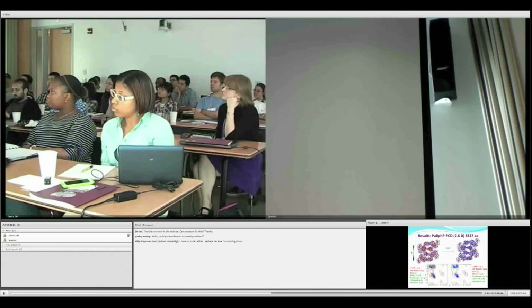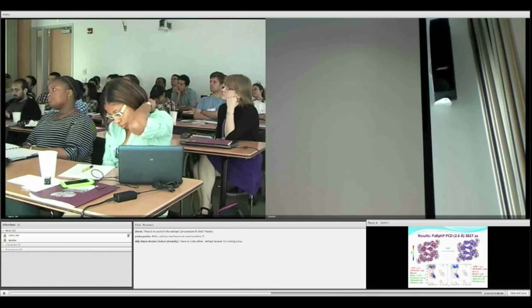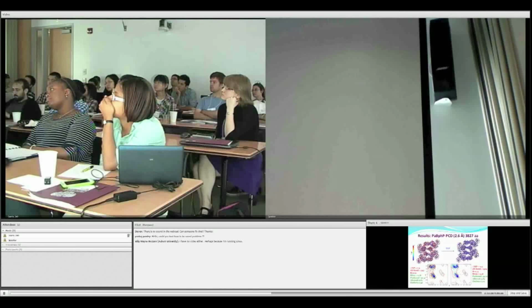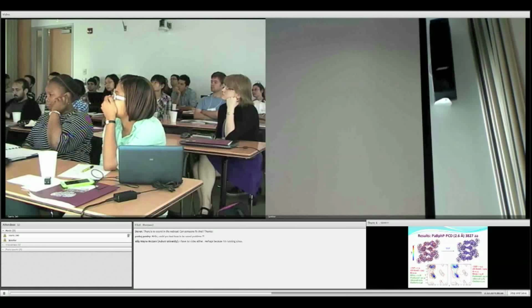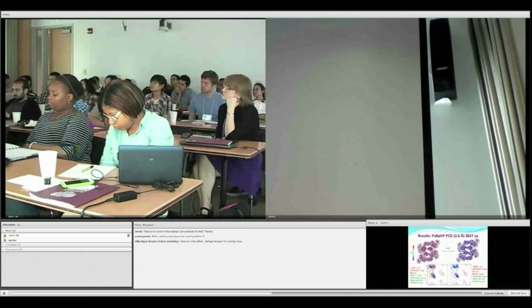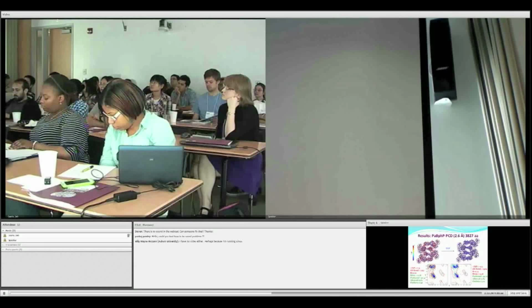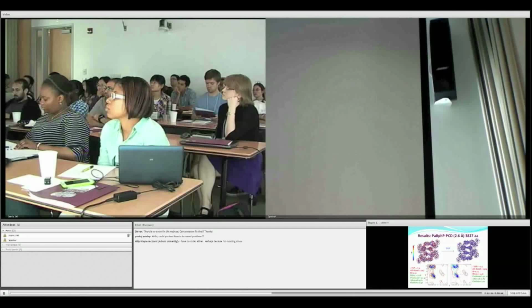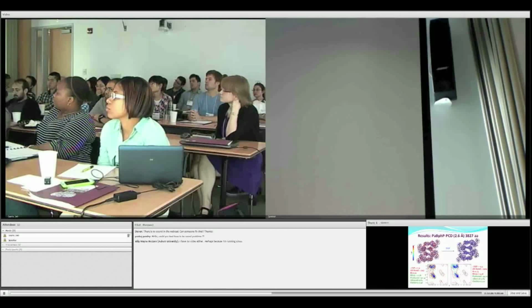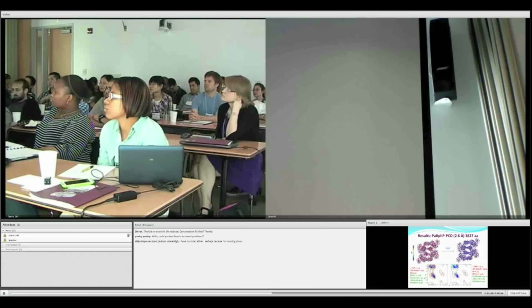But this ran through a server. This was the starting structure. Again, red means bad regions, blue means good regions. You can see that the result is pretty much blue after going through our server. Here are some statistics. We start with a TSP of 2.9. This is the TSP3 average value. We gain a TSP of minus 0.2. The hydrogen bonds improved a lot. We gain about 600 hydrogen bonds.